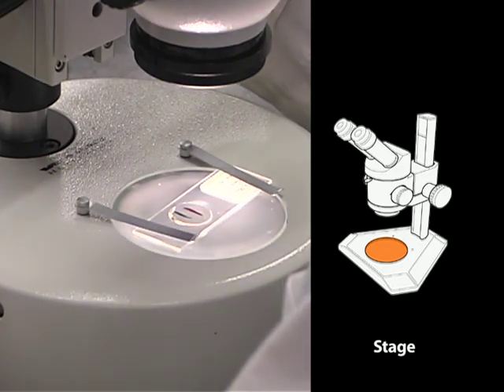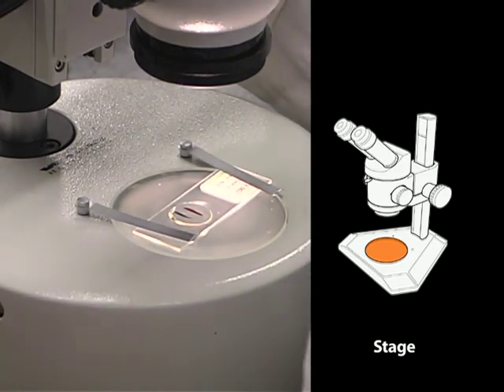For transmitted light, the stage plate is usually frosted glass to diffuse the light evenly across the stage.